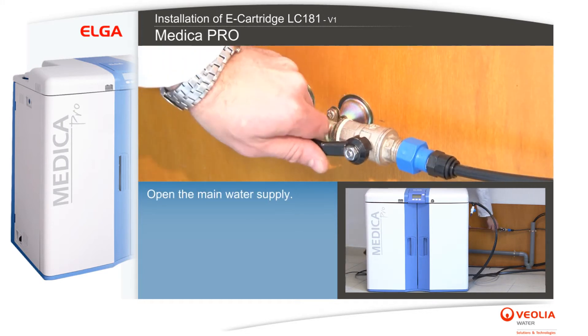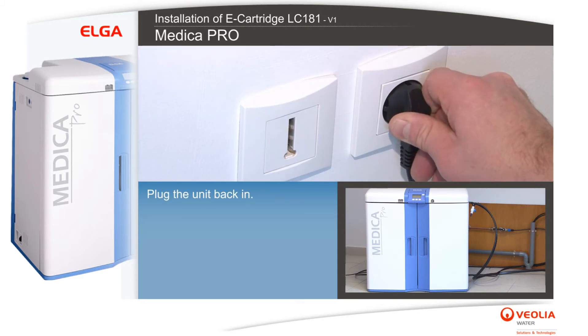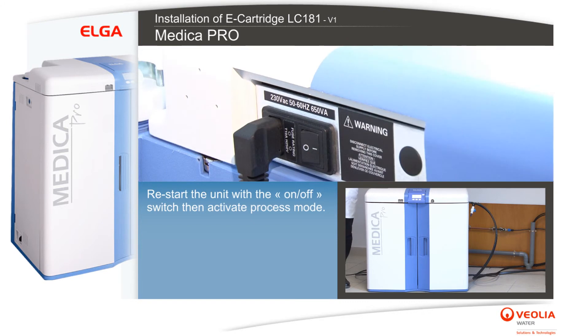Open the main water supply, plug the unit back in, and restart the unit with the on/off switch. Then activate process mode.